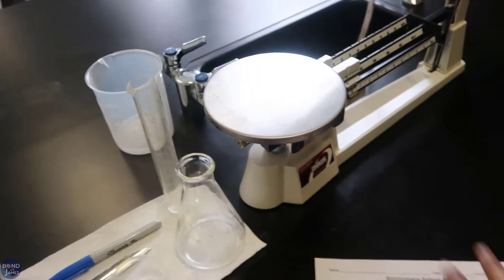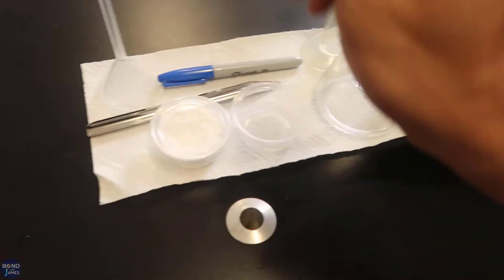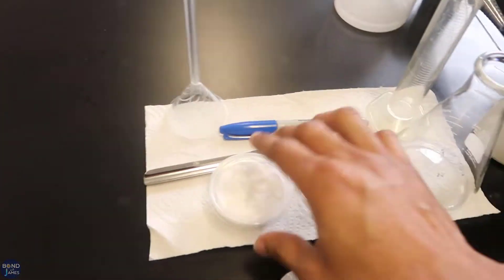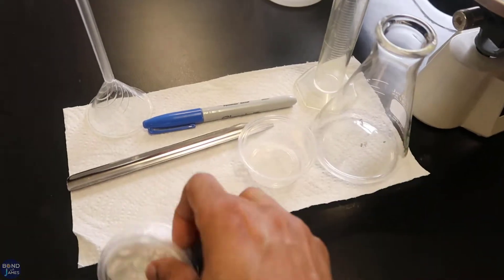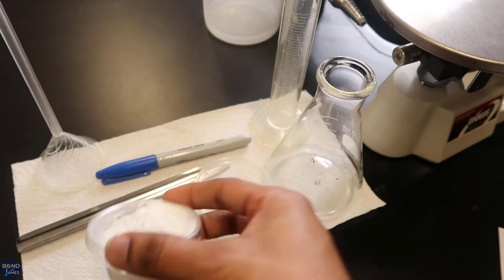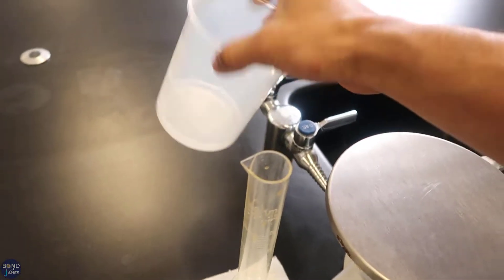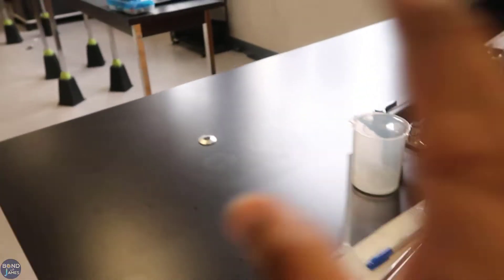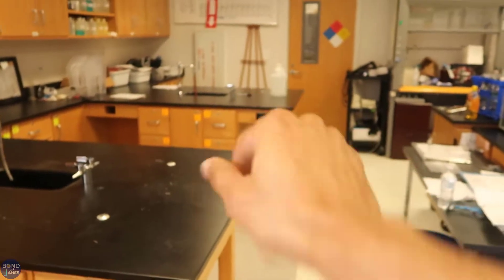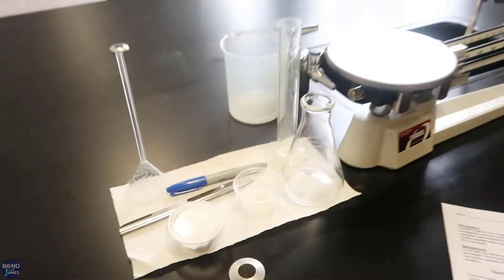The students worked in pairs at each table. They all got a triple beam balance, a flask, a graduated cylinder, a funnel, a clear plastic container, a container full of baking soda, and then a beaker to share with vinegar in between. There were six pairs. And then also they each got a balloon.